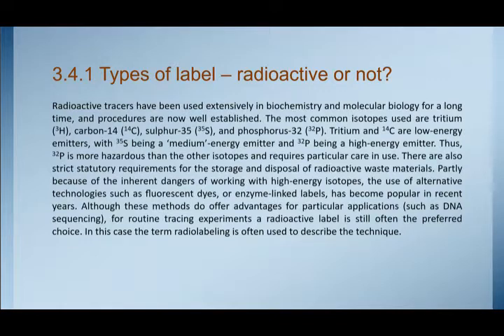The use of alternative technologies such as fluorescent dyes or enzyme linked labels has become popular in recent years. Although these methods do offer advantages for particular applications, such as DNA sequencing, for routine tracing experiments, a radioactive label is still often the preferred choice. In this case, the term radiolabeling is often used to describe the technique.